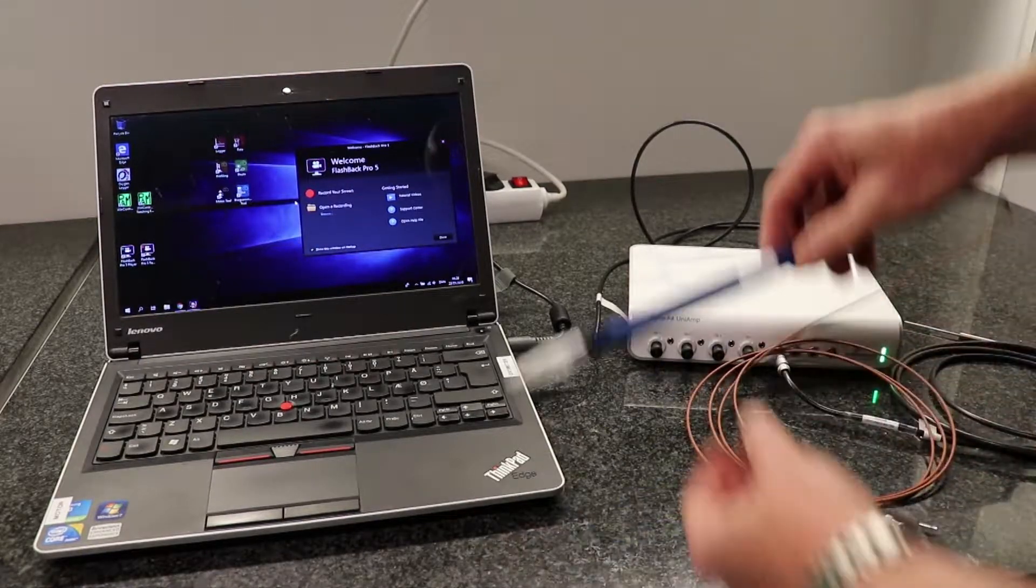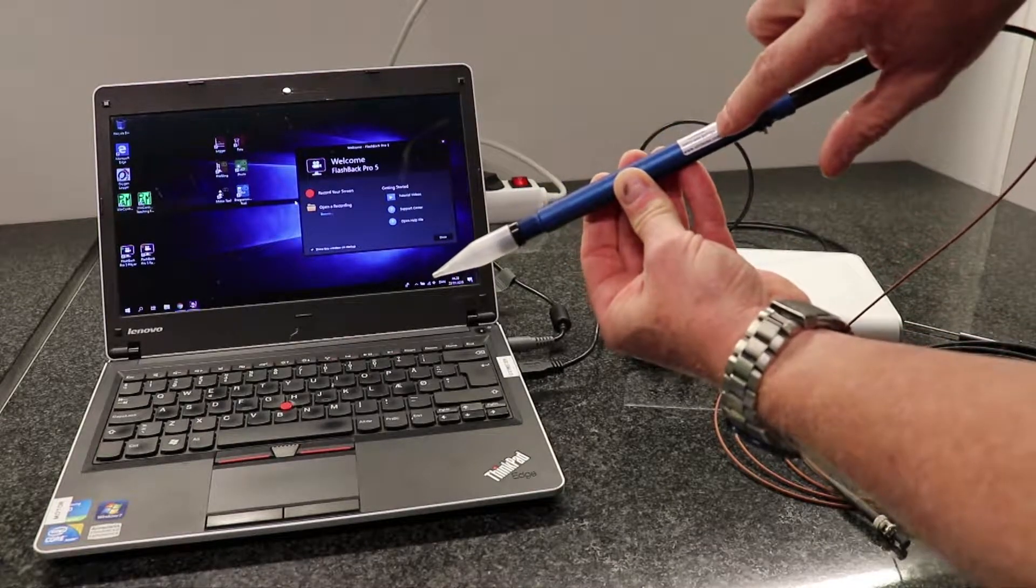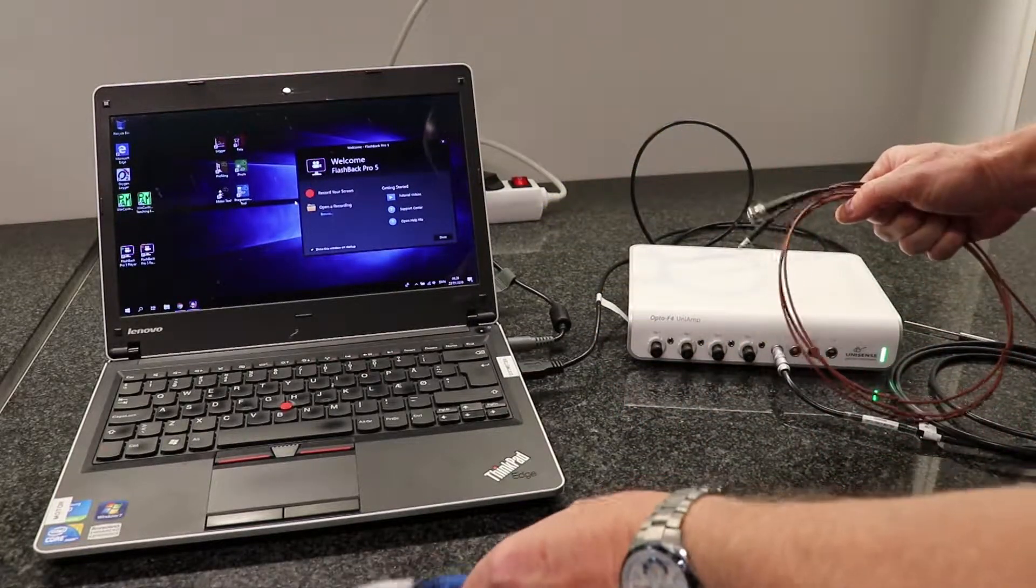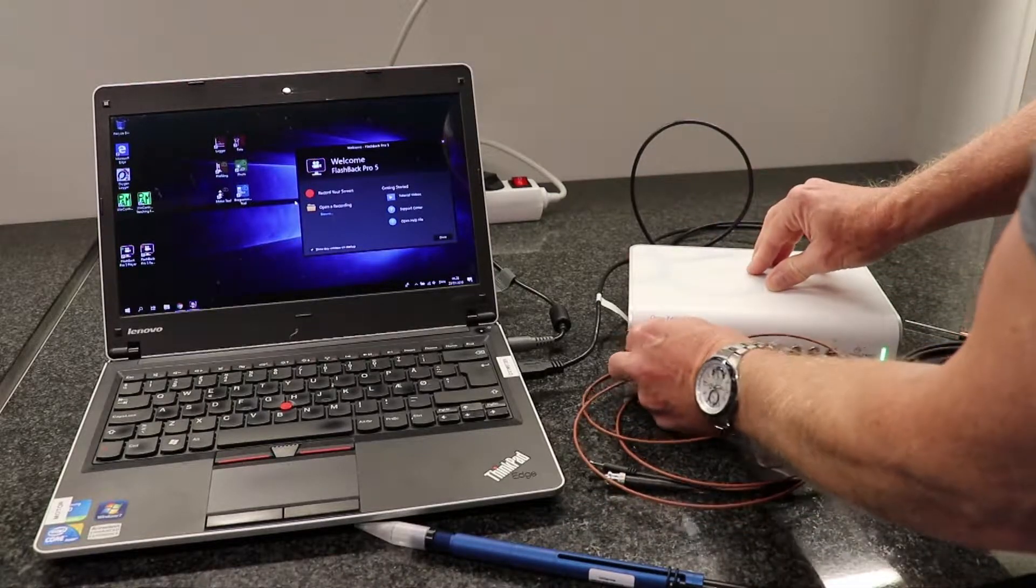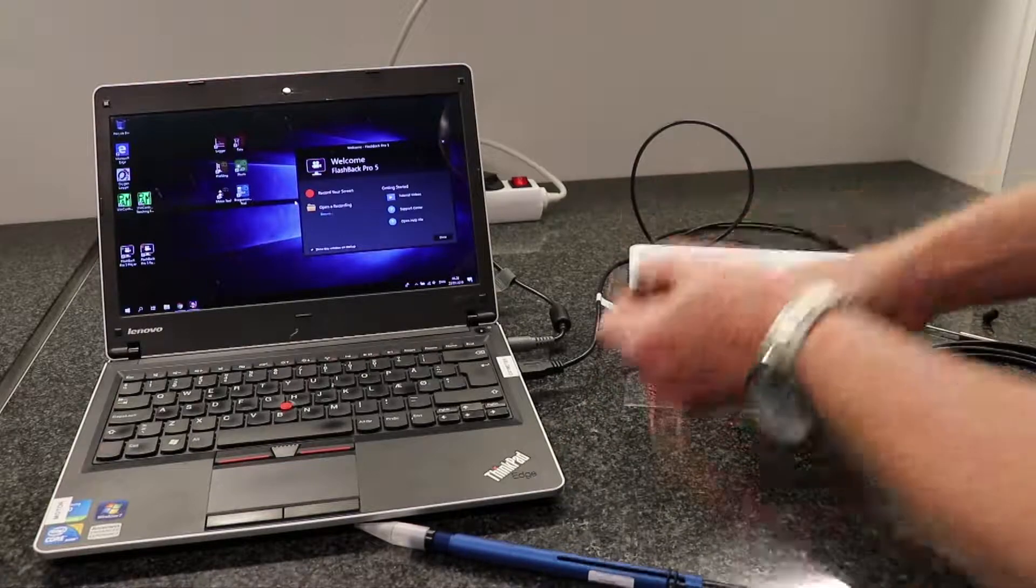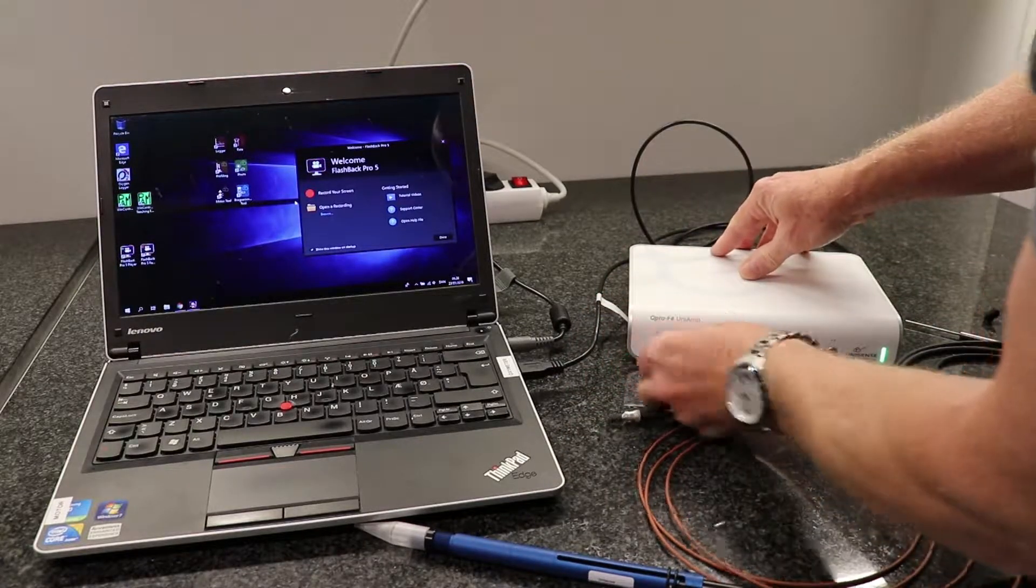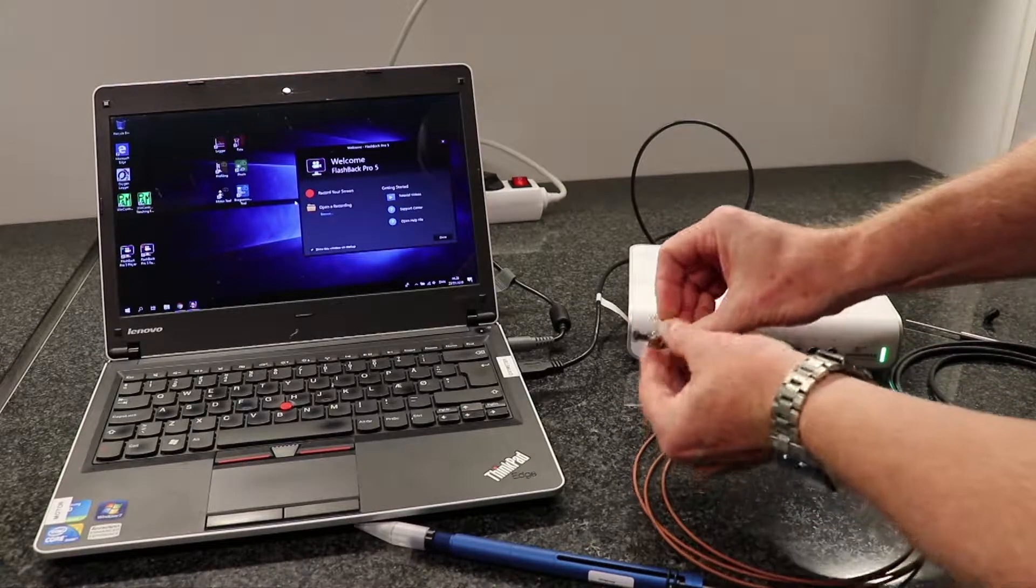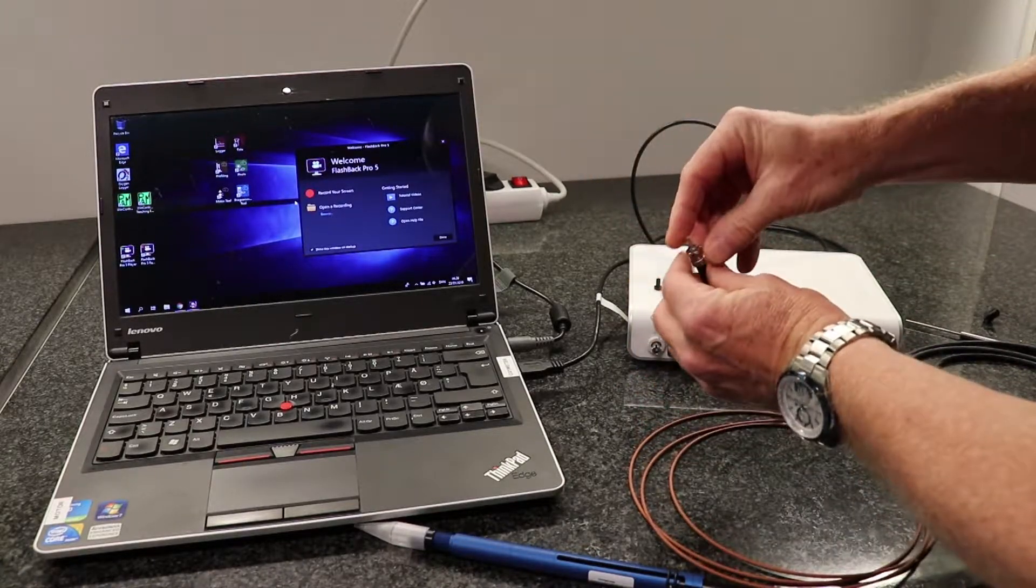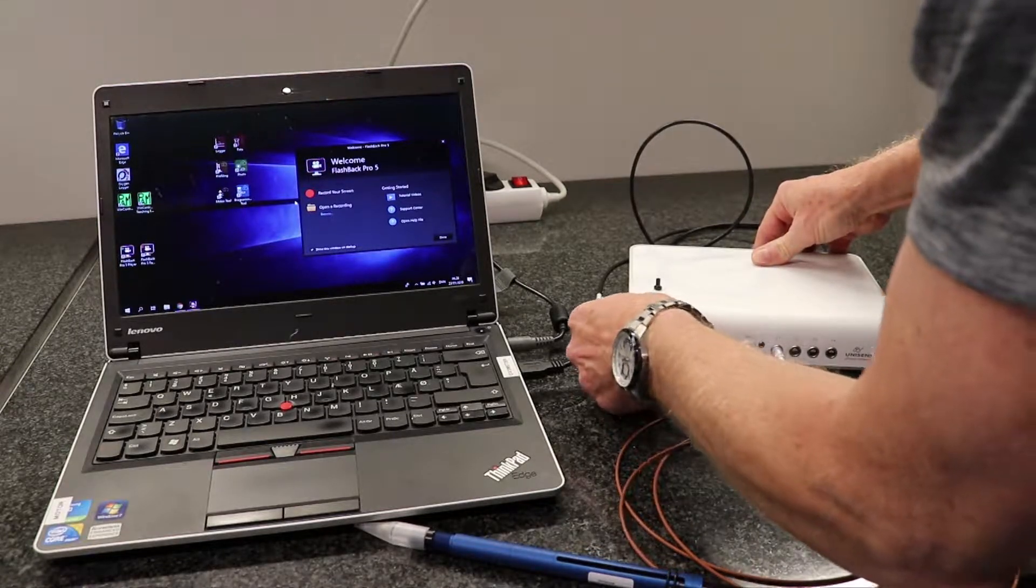Now take the optode and write down the serial number so you can always trace back the optode. First remove the dust cap from the optical port, then insert the mini jack in channel number one. Remove the dust cap and insert the optical connector.